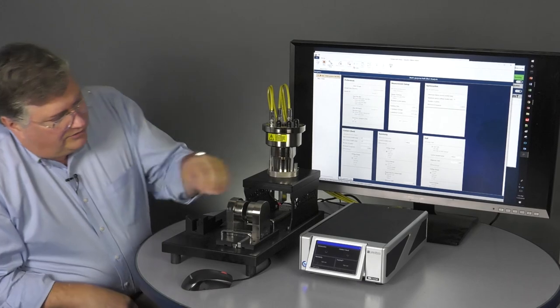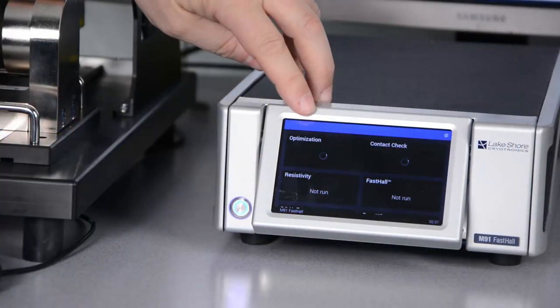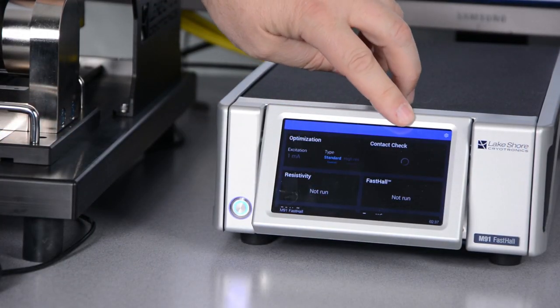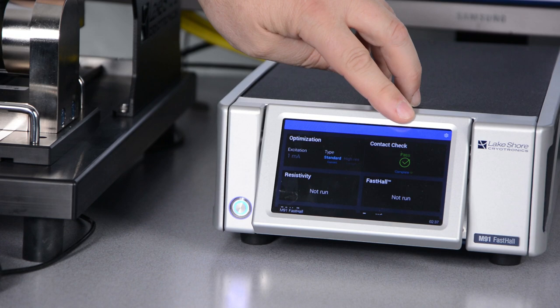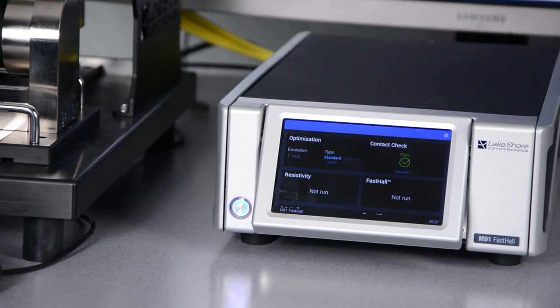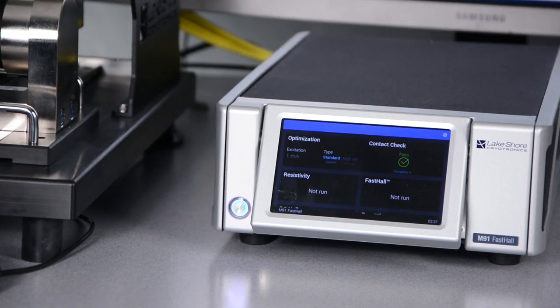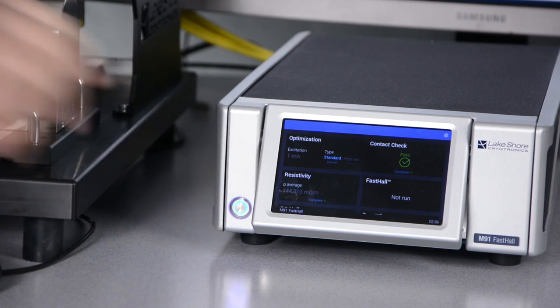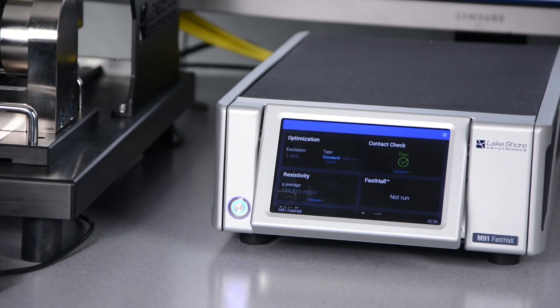So I hit Start. Notice the first thing that happens is we get the optimization running. Then it runs a contact check. Getting a lot of data filling in in the background on MeasureLink. And then here we're running the resistivity value.